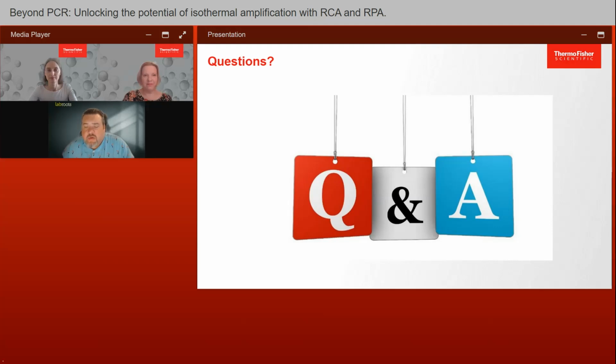All right, thank you. Let's see, the next one we have here: Raminta, what are the rules or guidelines for designing padlock probes? Oh, you're still on mute there. Good. Okay, so now you can hear me.